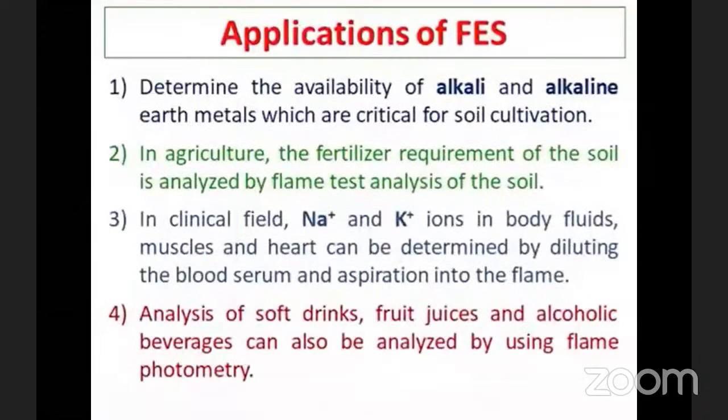Let us see the applications of flame emission spectroscopy. Flame emission spectroscopy can be used to determine the availability of alkali and alkaline earth metals, which are critical for soil cultivation. In agriculture, the fertilizer requirement of the soil is analyzed by flame test analysis of the soil.